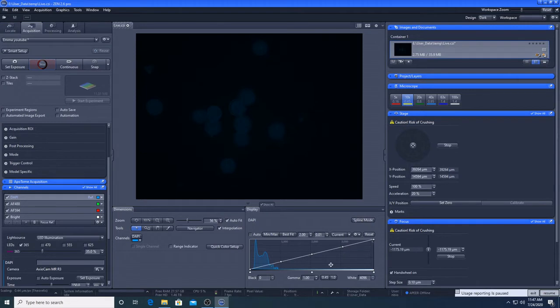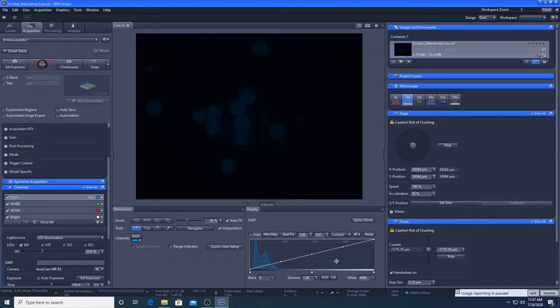You want all of the pixels in your image to fall within the measurable range. Specifically, you want to avoid saturation, which occurs with pixels measuring at 4096, as a result of the excitation light intensity being too bright and/or the exposure time being too long for your sample.